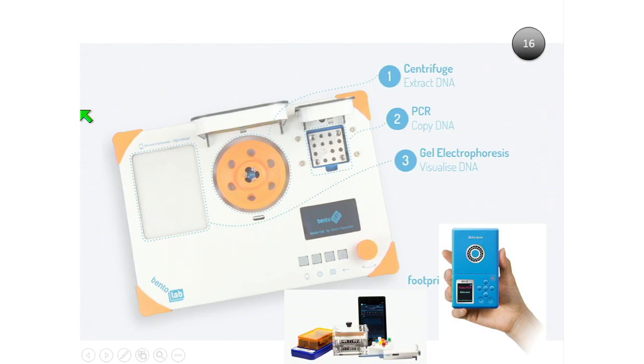And to make this happen, make this easier, we need to reduce the footprint and we need to reduce the complexity of doing it. So we're really focusing now on how we can make this process easier. We've got a very, very small, very portable sequencer that's battery powered. We now need to miniaturize and sort out all the rest of the lab stuff and the bioinformatics so that it can be as reactive as the sequencer.